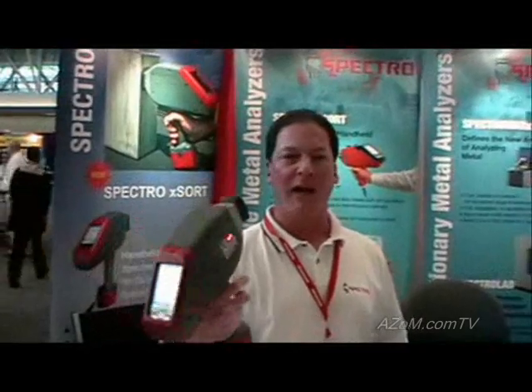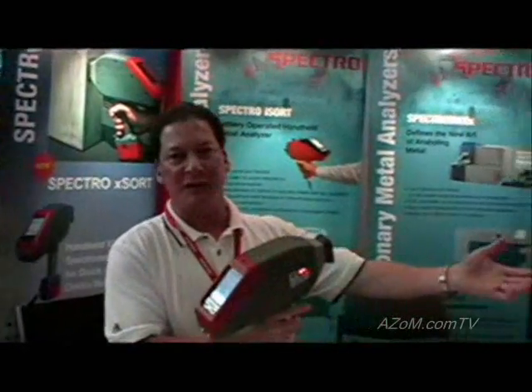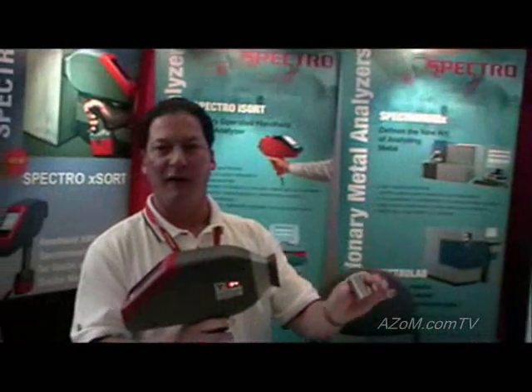Hello, my name is John Kelly. I work for Spectroanalytical Instruments, and I'd like to demonstrate our new handheld X-ray unit, which is right here. My colleague Dan Soyson will do the talking and technical part while I run a sample for you right here.